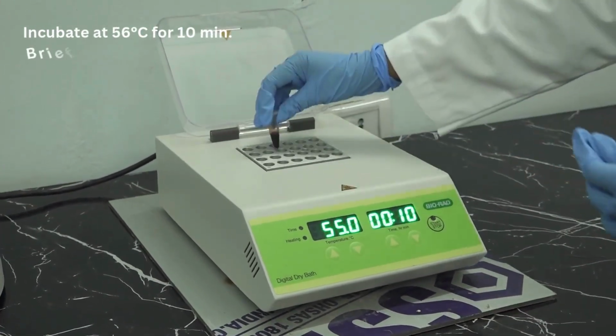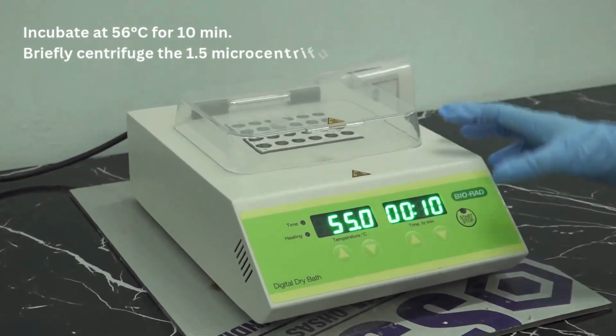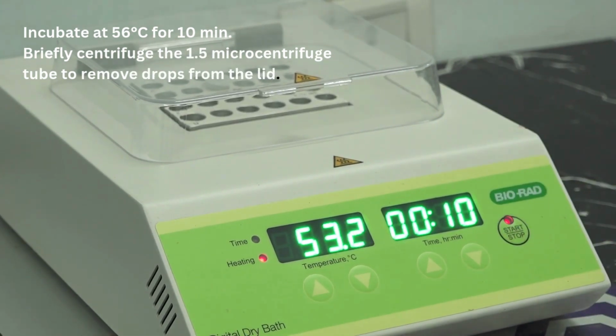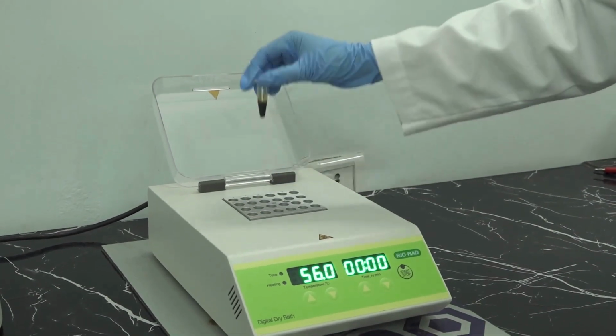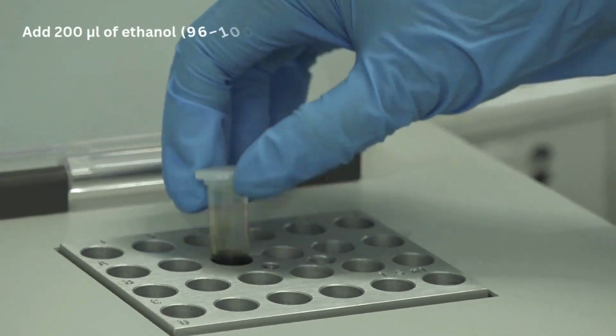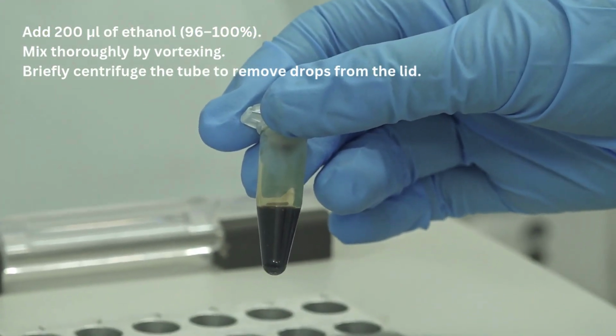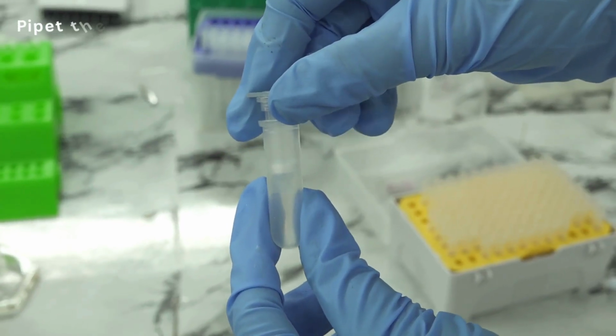Incubate at 56 degrees Celsius for 10 minutes. Briefly centrifuge the 1.5 milliliter microcentrifuge tube to remove drops from the lid. Add 200 microliters of ethanol. Mix thoroughly by vortexing and briefly centrifuge the tube to remove drops from the lid.